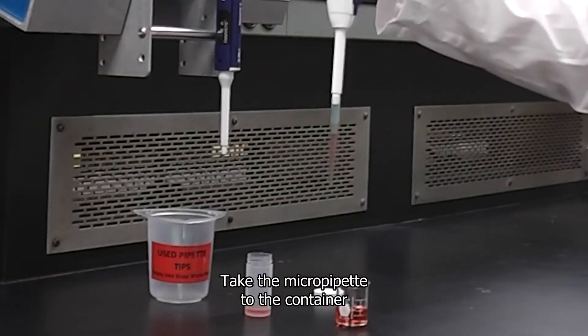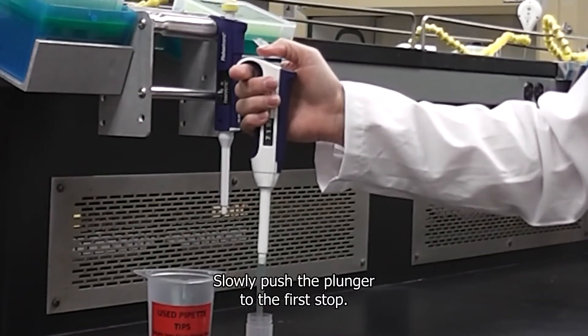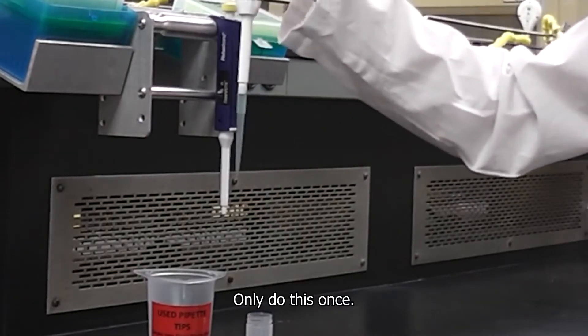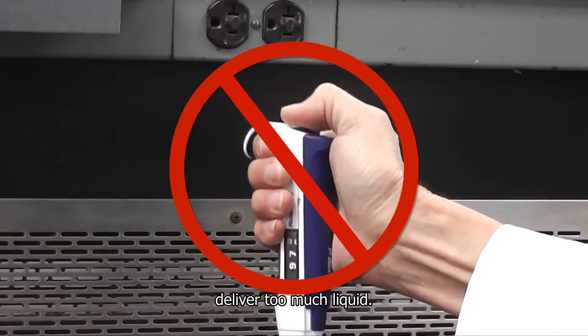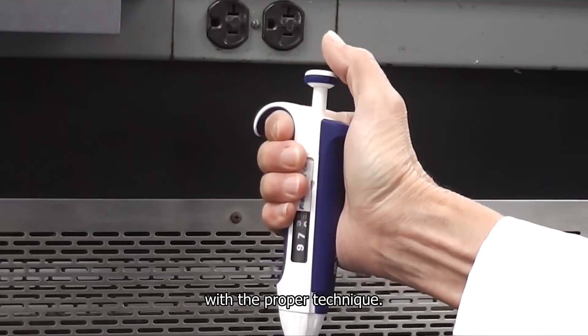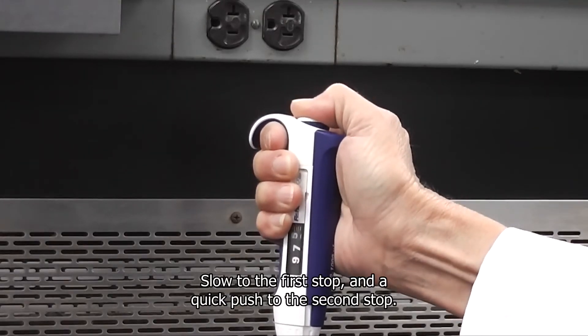Take the micropipet to the container you are pipetting into. Slowly push the plunger to the first stop, then quickly push it to the second stop — only do this once. Repeatedly depressing the plunger can deliver too much liquid. Micropipets are designed to deliver the correct amount with proper technique: slow to the first stop and a quick push to the second stop.